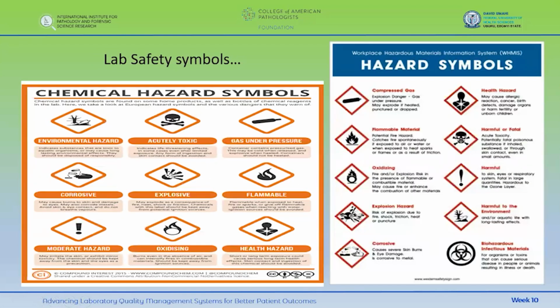We have covered many of them here. Compressed gases, harmful. We have covered many of them. Okay, so these are the general lab safety symbols which we should be familiar with.